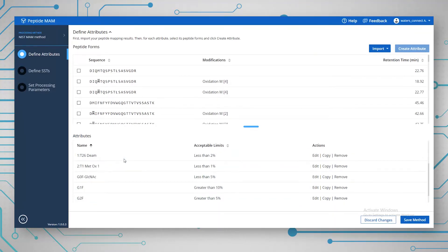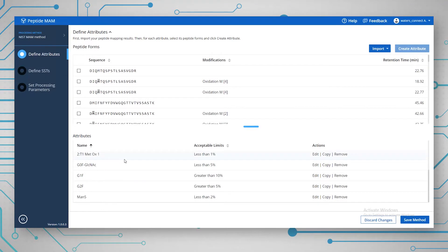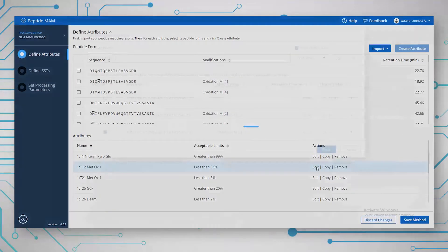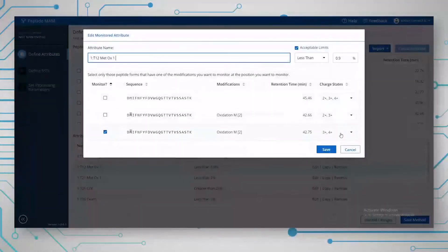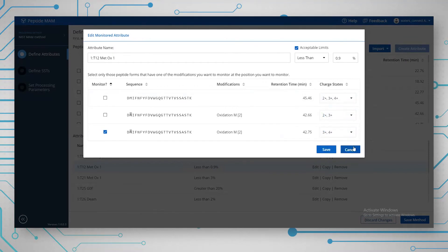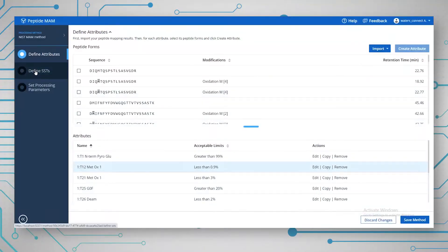You can also define the charge states you want to look at — this is automatically brought in from Unify, but you have some control over which charge states you examine. So that's bringing in the attributes.